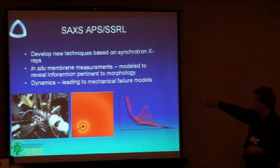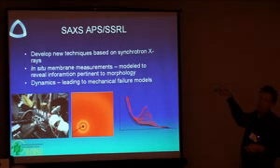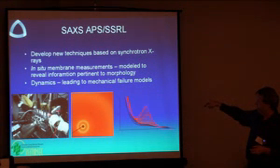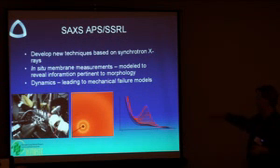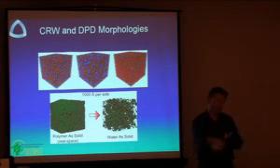So this is basically the beamline from a synchrotron, which would be back here in the wall, with electrons whizzing around at 99.9999% the speed of light. They go through an undulator, they give up energy, and beautiful X-rays come out here. And we shoot them from here, and we basically scatter them, and we have a photographic plate or a CCD detector. We get a pattern like this, which we transform into a SAXS pattern like this. And then we basically say cool things about this, or we actually go one step further and come out with a model of the system.